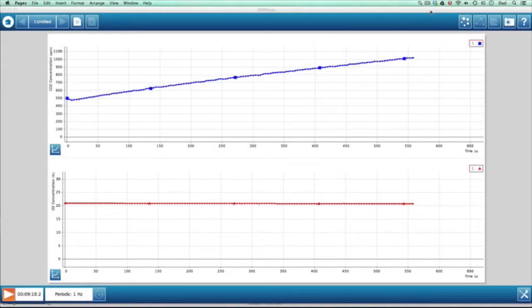All right, we've got about 45 seconds left before we reach the 10-minute mark. As you can see, the CO2 level has continued to climb in the photosynthetic tank, whereas the O2 is pretty smooth, kind of even throughout the entire process. In about 30 seconds, I'm going to take off the cloths and turn on the lights. So I want you to start taking a look at if there will be any changes at all.